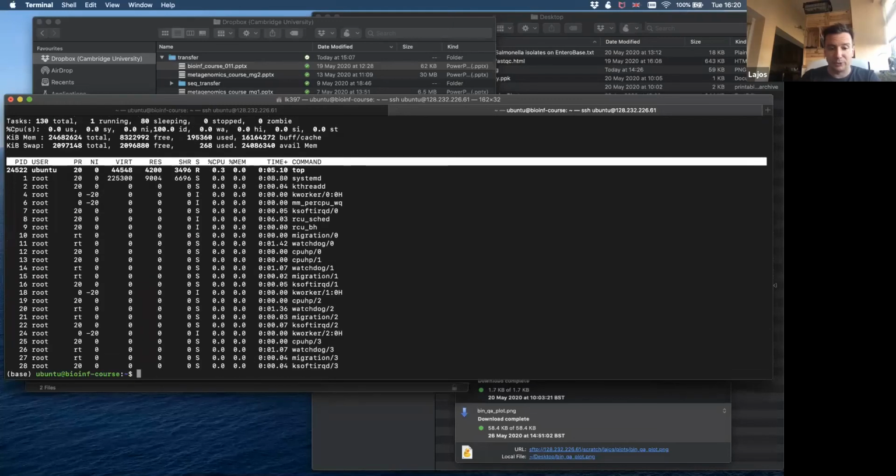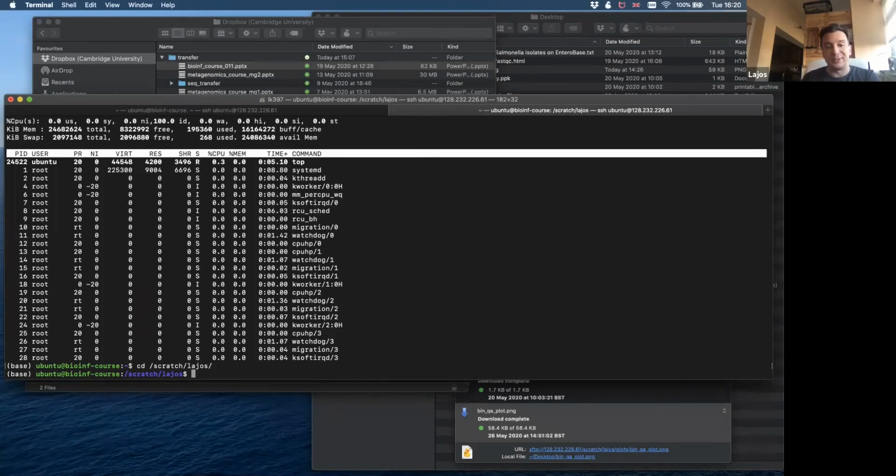So if I'm just going to my Scratch folder, if you have multiple command line commands, and you know that you will run those commands after each other, always in the same order and with the same commands, you can put them into one file and run that one file instead of running all of these commands separately.